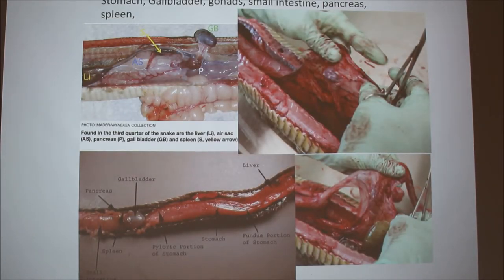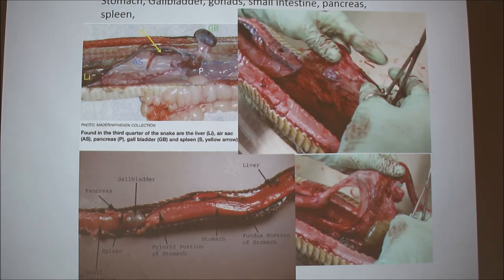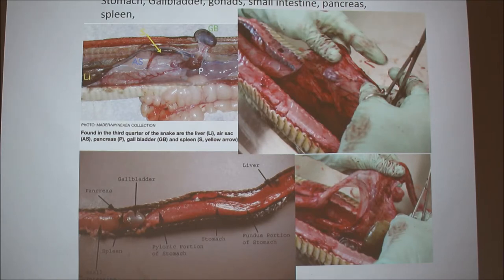The first thing I thought of when I saw the third quarter was just a stuffed body — it has all the things. It's usually the first place you can identify things and usually the place you spend the most time, because there are so many organs. But one of the easiest things to find is the gallbladder — it's just this green blob. They removed it here so you can see the pancreas and the spleen, which are very close and usually attached to the gallbladder. The gallbladder is always this big green shape — I believe it's due to the bile. They need it for fat emulsification, since most snakes eat animals with a lot of subcutaneous and visceral fat. You wouldn't be surprised they have a gallbladder, whereas a horse doesn't have one because they never eat anything fatty.